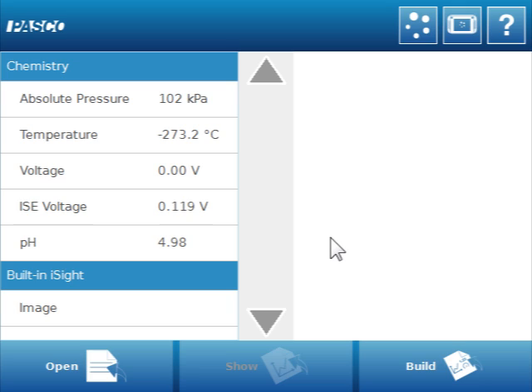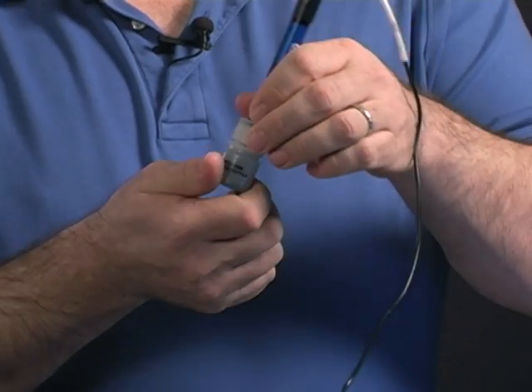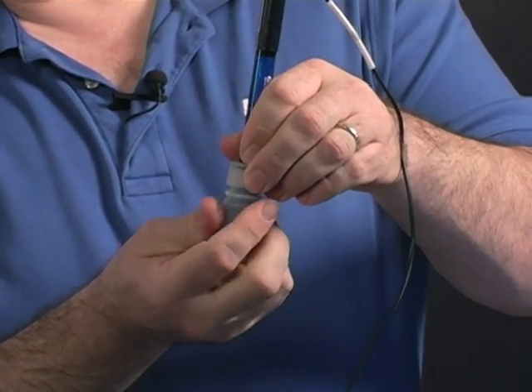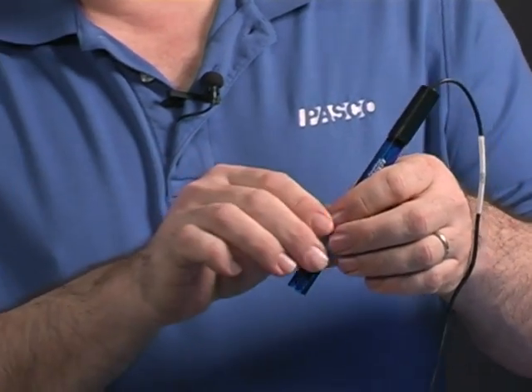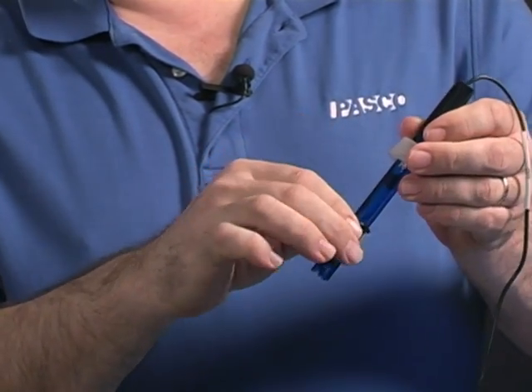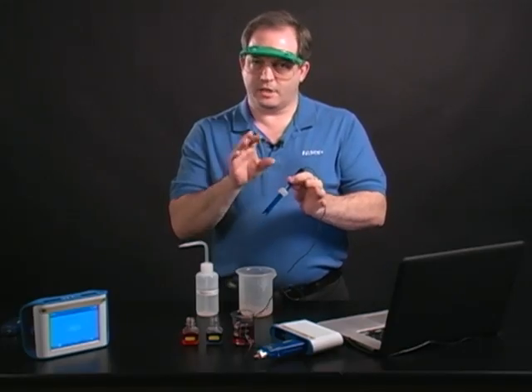You'll see on my screen that I have a variety of measurements now showing up. I'm going to take the pH probe and remove the soaker bottle that comes with it carefully. I'll set that aside and move it back out of the way so I can still take measurements even though the cap is still there.